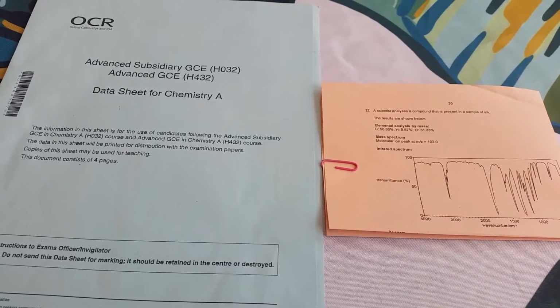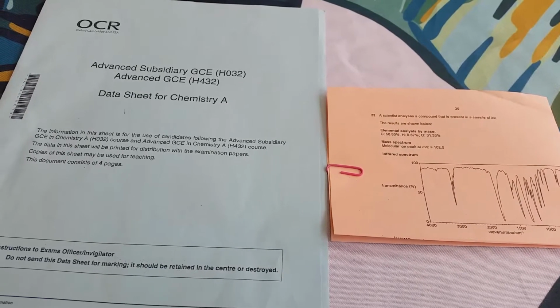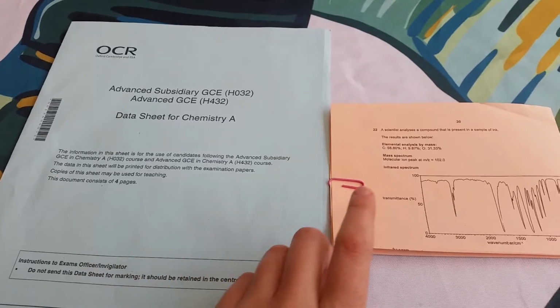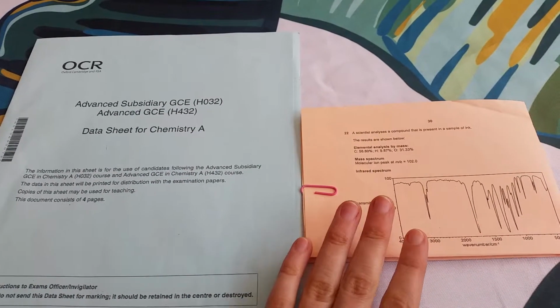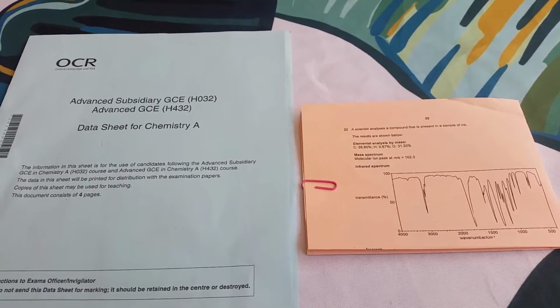I'm Liz, and in this short video I'm going to show you how to interpret an infrared spectrum. What you'll need is a datasheet, and to illustrate this I've got a past paper question. It's actually from one of the OCR practice papers in 2016.